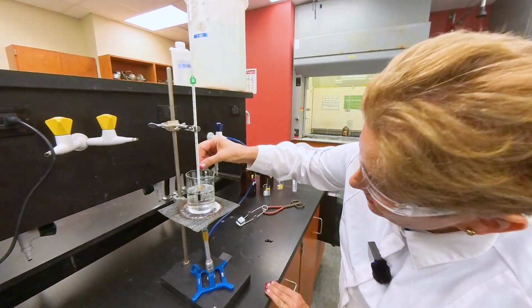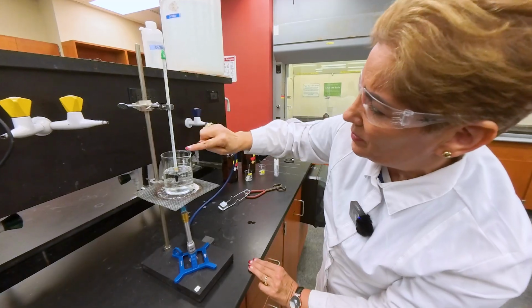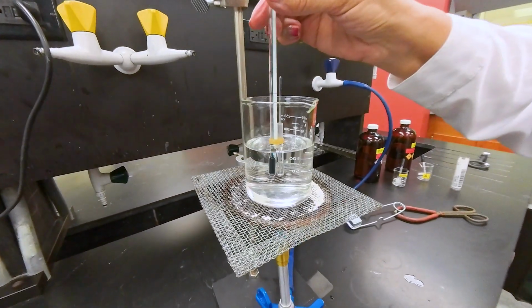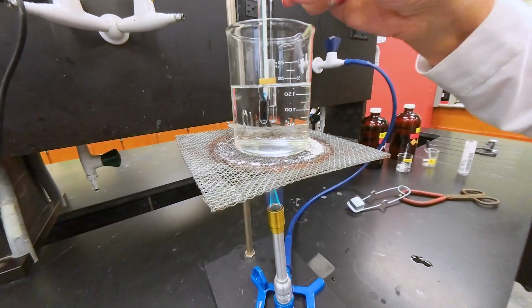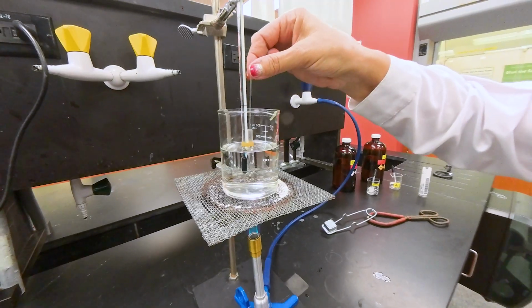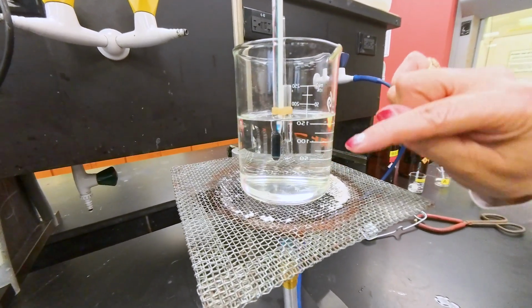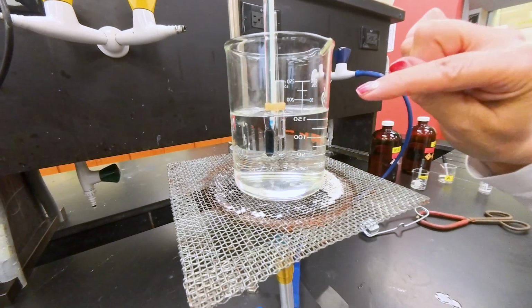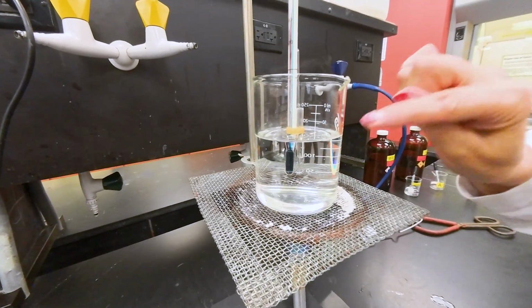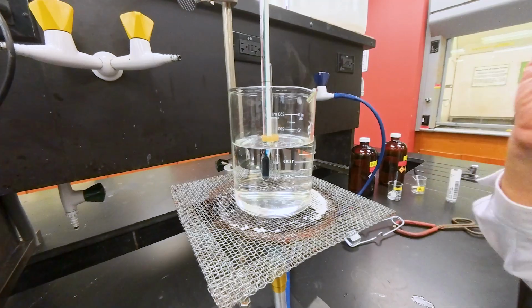And I'll tell you what happens when it starts boiling. I see that the temperature is going up because it's being heated. When the sample starts boiling, it's going to change to gas. And the liquid inside the capillary tube also starts boiling, and since it's gas, it's going to come out of the open end of the capillary tube, very fast.